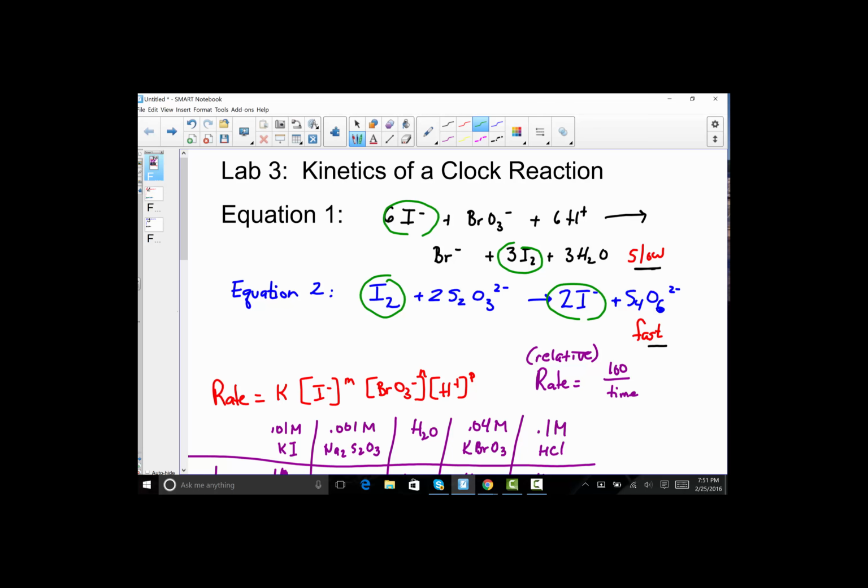So it's this continuous process of using and then making and then using the iodide ion, back into the molecular form of iodine. And so what happens is this reaction continues until the reactants are consumed and we run out of the individual iodide. Now, in the presence of starch, the molecular iodine that forms here is going to instantly turn blue.